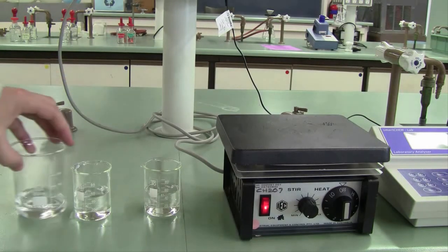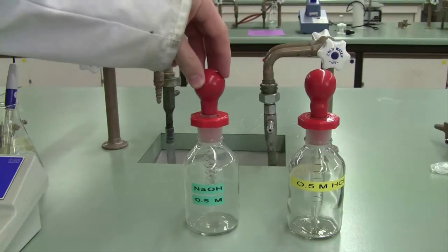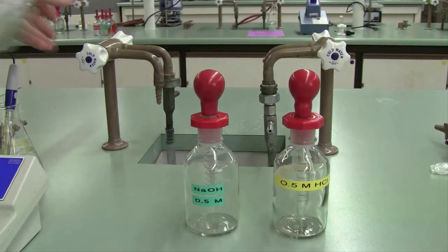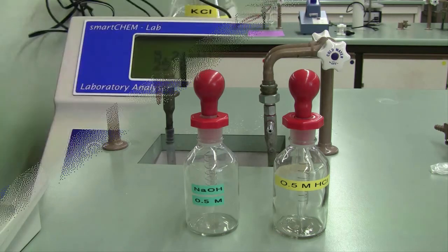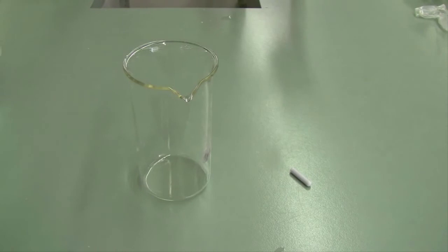We're then going to observe the properties of a buffer by adding sodium hydroxide, hydrochloric acid, and tap water to our different buffer solutions, and watching the effect that that has on the pH. When you finish this section of the experiment, please make sure you don't tip the magnetic stirrer bar, the flea, down the sink.